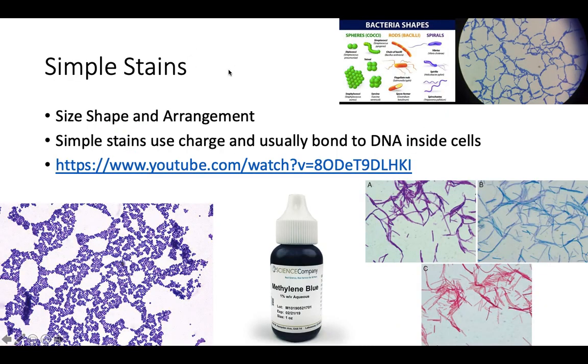So the first type of stain that you will encounter in a microbiology lab is something called a simple stain. Now, a simple stain, as you can see here, is a positive type stain. It gives bacteria their color from the inside. Simple stains commonly use methylene blue, a very common type of stain. This is what this blue color comes from. Another color here, this is probably crystal violet, actually. Methylene blue here, crystal violet, and safranin.